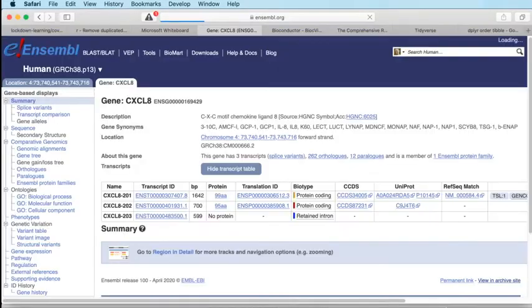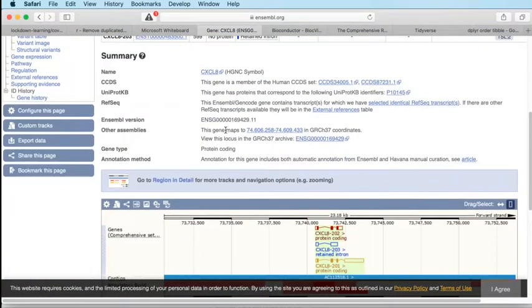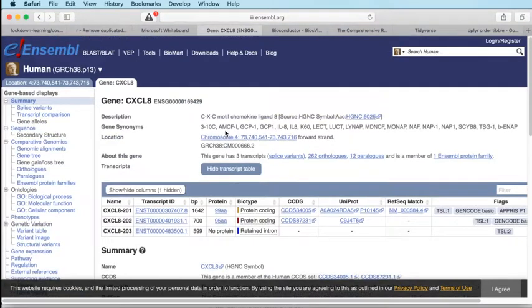Just because I don't want to leave you completely hanging until next week. Okay, so here we go. That gene is CXCL8. So I've just searched Ensembl for the Ensembl gene ID. It's a chemokine ligand, so yes, involved in some way in the immune response, presumably. So that sort of makes sense in terms of a result. So there you go. That's our top, in terms of p-value anyway, differentially expressed gene in this data set.